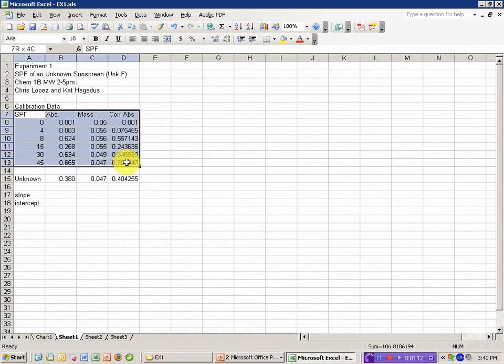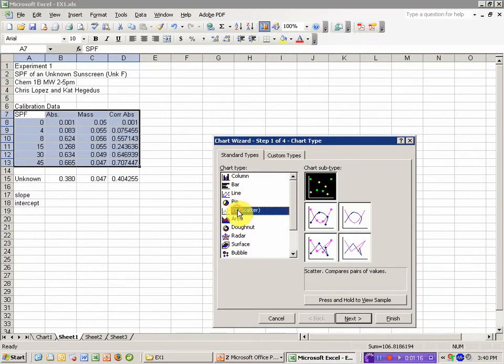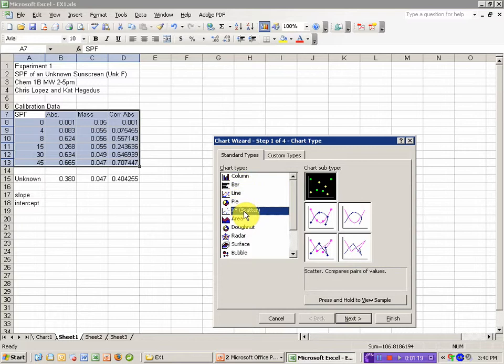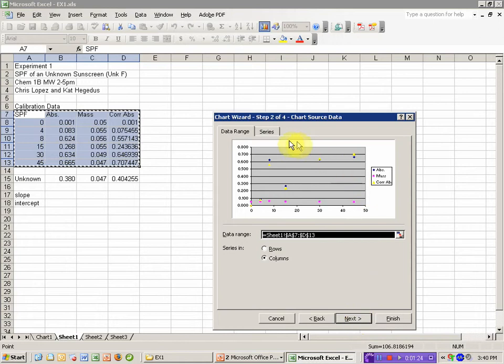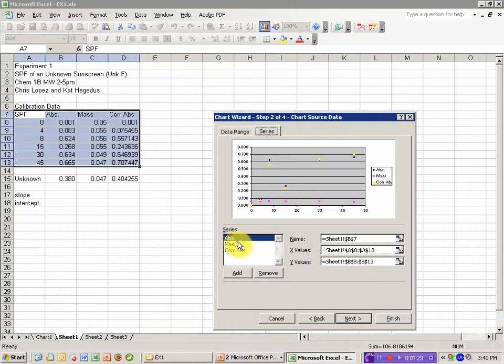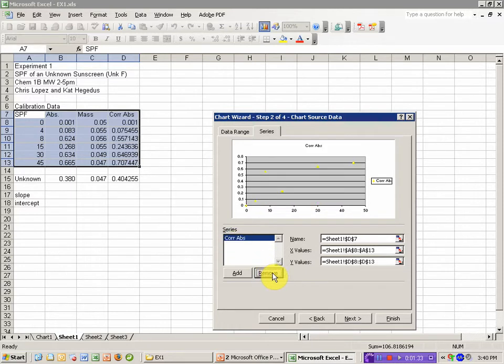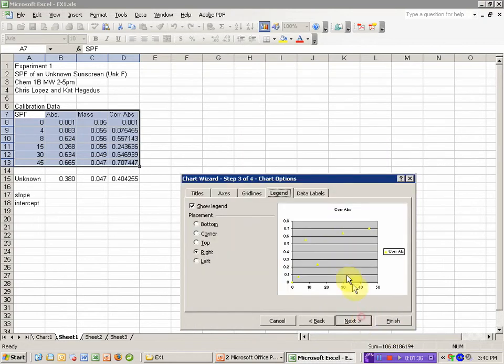Next, I want to plot this data to get a look at what I might want to do with it if there's any data points that don't make sense. I need to be sure to use XY scatter, and I'm just going to plot the data points by themselves at this stage. I have some extra series in here I don't need. I'm trying to plot corrected absorbance versus SPF, so I'm going to remove the raw absorbance and the mass. And there's my data.